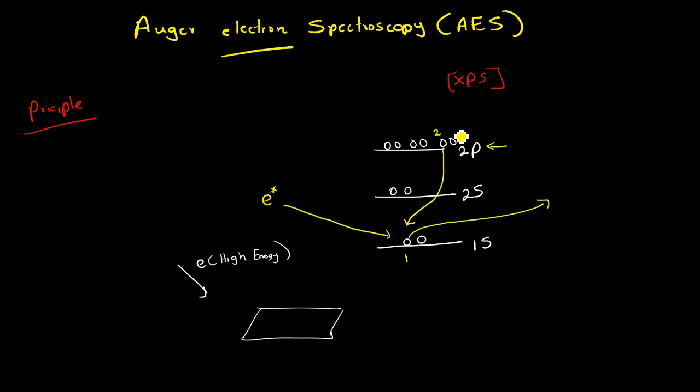So what happens is, this electron, let me take a blue color, will contribute some of its energy towards the neighboring electron, and then it will come down here to occupy the vacant position. Now look at this electron. I will denote it as number 3. There's a problem here, because originally this electron has a specific energy value and occupies the 2p level.